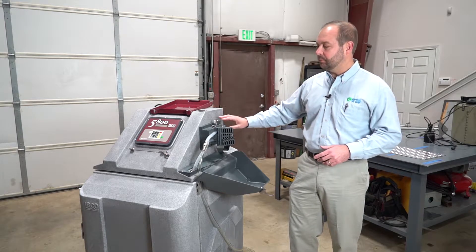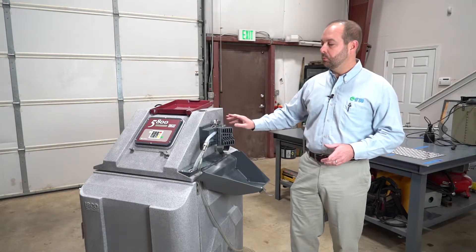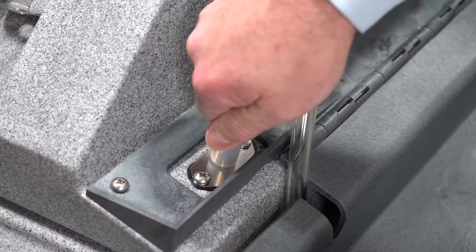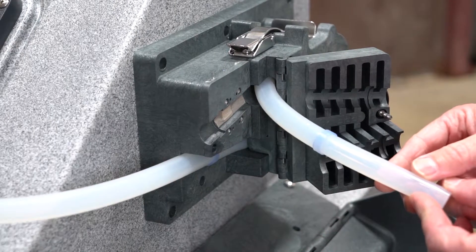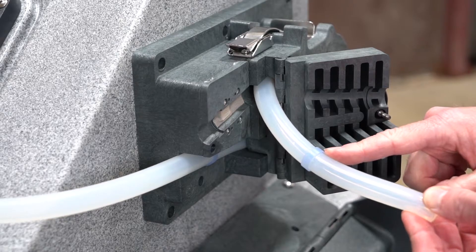The pump assembly components that we will be discussing today include the bulkhead fitting, tubing coupler, and pump tube.